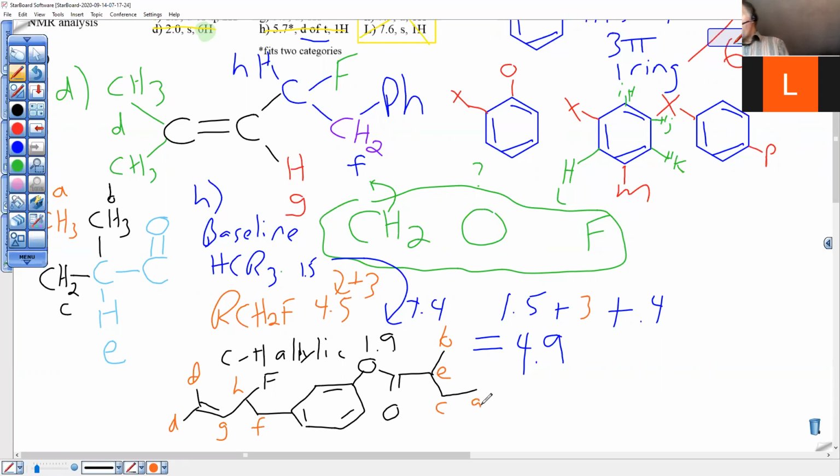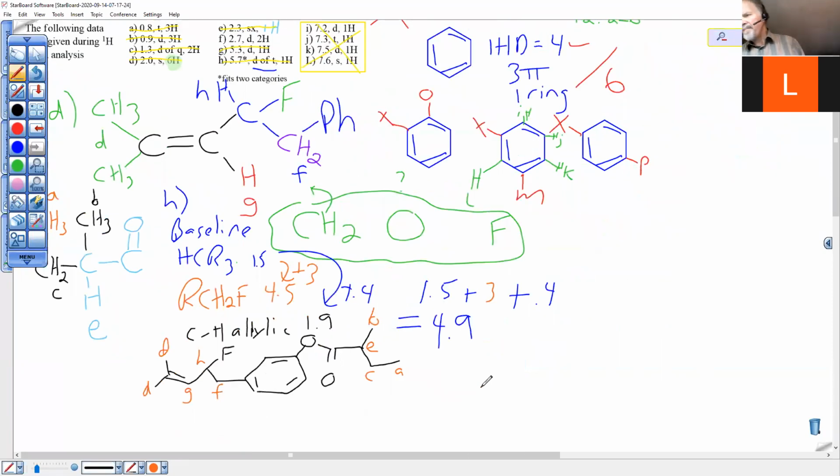And in the benzene area, the ones closest to oxygen, the electronegative atom, should be the two highest, 7.5 and 7.6, because of inductive effects. The singlet has to be here, L. No neighbors, K close by as well. And these are interchangeable pretty much. I'll pick the one closer to O to have the slightly higher number. And I would be the last one.